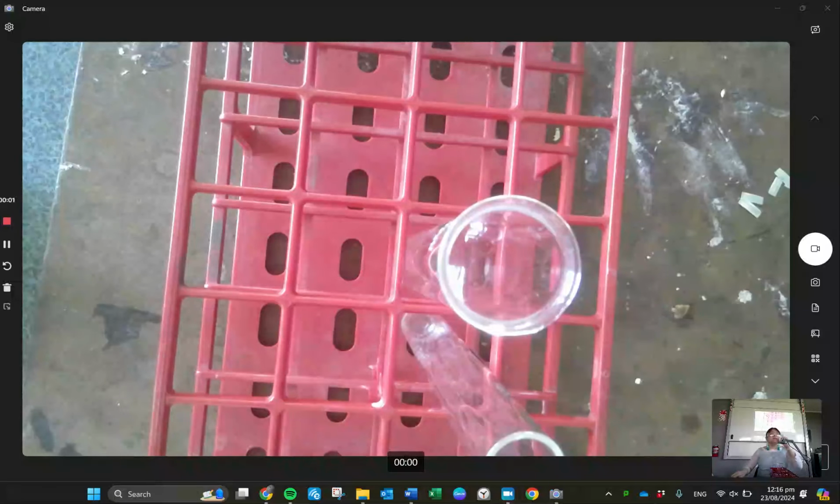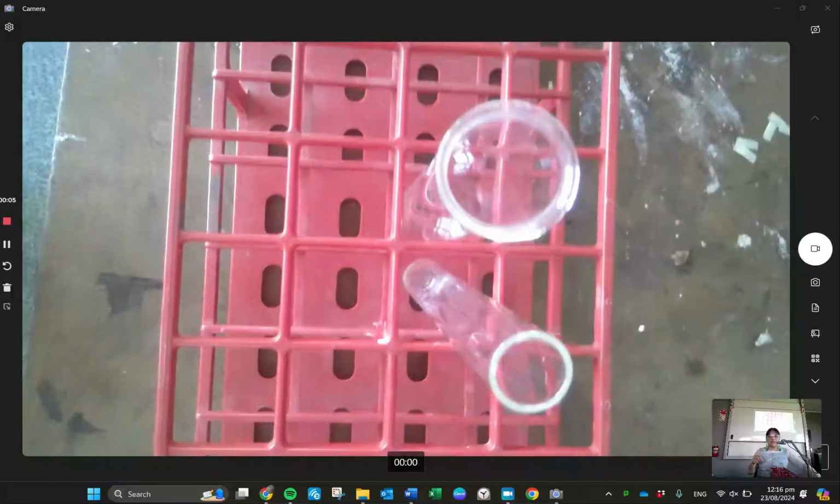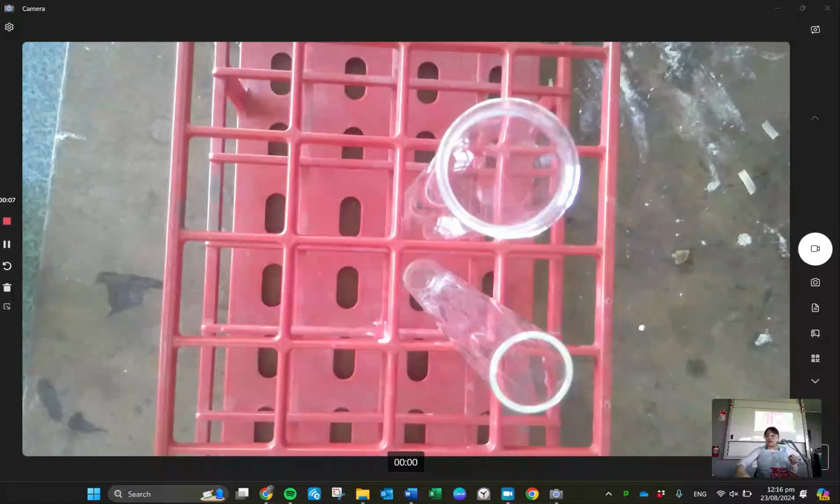Okay. So I have done the pop test with you guys. I totally forgot that I had. We're going to do it again though. All right. So we are going to take some magnesium.